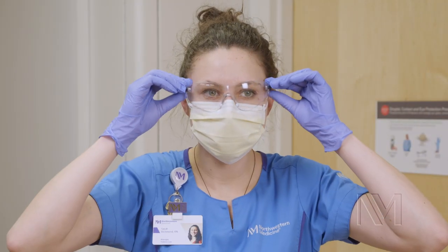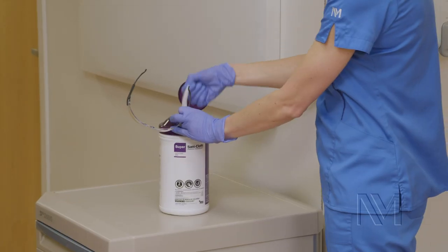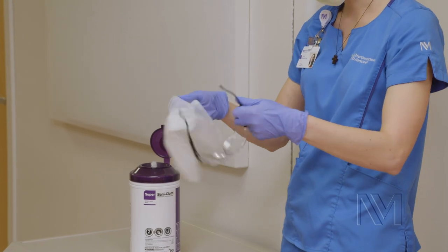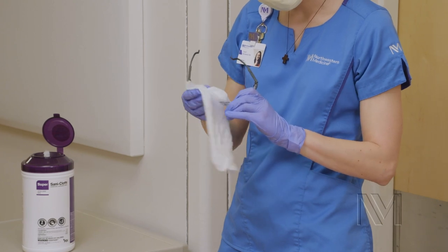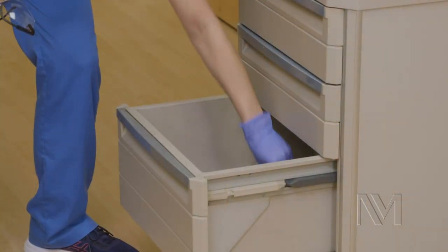Remove your eye protection from the back or sides, being careful not to touch the front of your eye protection. Clean and disinfect your reusable eye protection with a hospital-approved disinfectant wipe. Adhere to the manufacturer's designated contact time. Place your eye protection in a clean location.